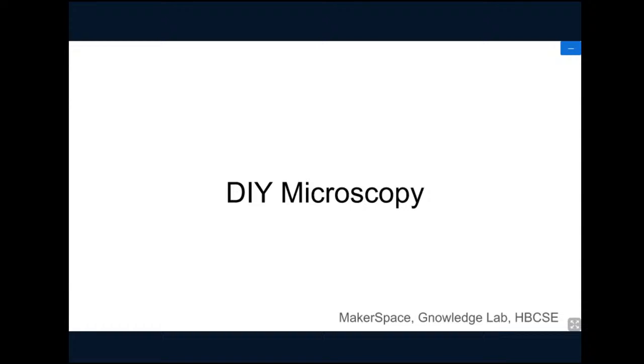Hello. Yes, Ashish, we can hear you. Hello everyone. So, today we'll be exploring the methods to do DIY microscopy. So basically, it is do-it-yourself microscopy.